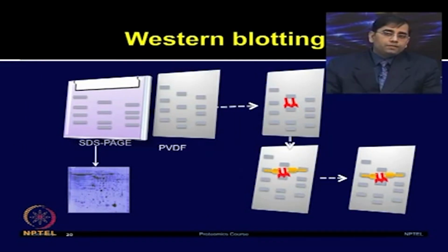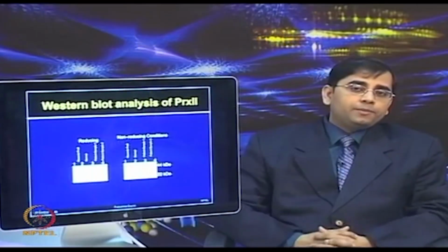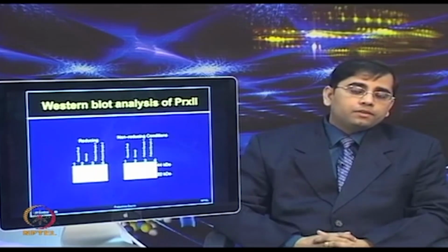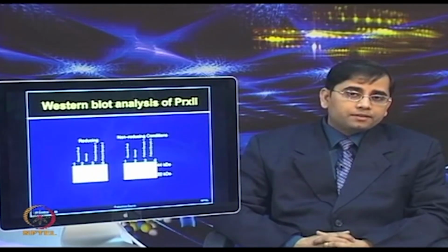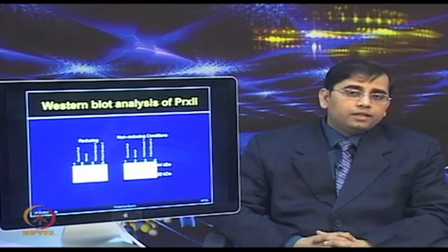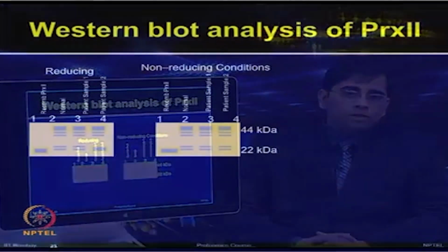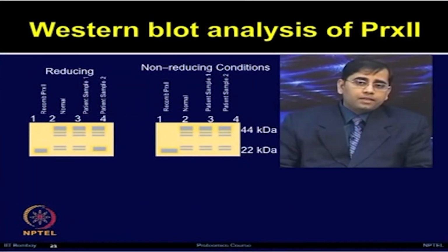After the identity of these proteins was established, Western blot analysis was used to validate a few targets. Among the identified proteins, the authors found that peroxiredoxin 2 was very interesting. So, they observed that an intracellular protein, PRX2, was exclusively found in the plasma of SARS patients, but was absent in the healthy individuals. These results demonstrated that PRX2 can be present in the monomeric or dimeric form.